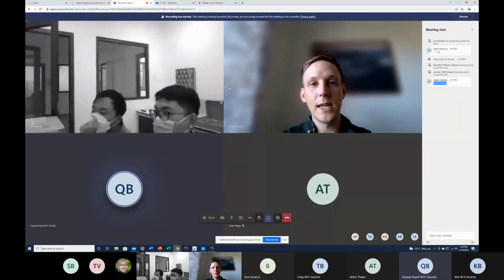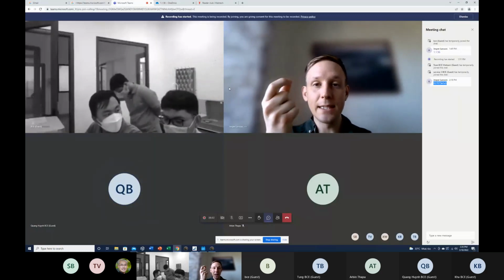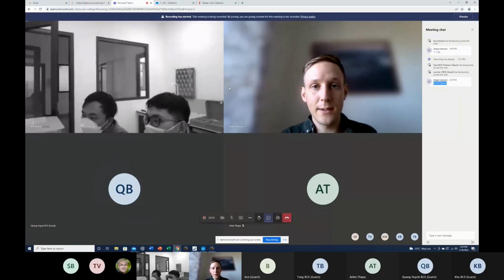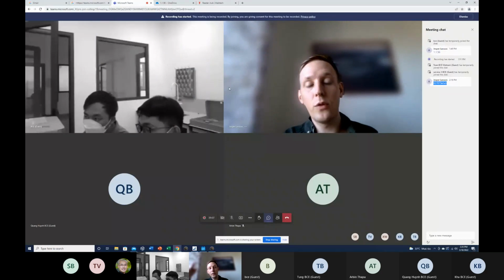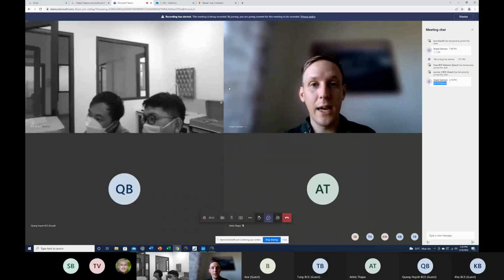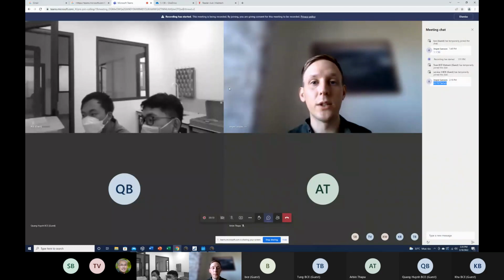Exactly. Every time you're moving the instrument, you're going to take this plate that you have received from us, and before packing it, you read it again and save it to the computer so that you have that readout. Then you move the instrument to the customer site, and at the customer site you're reading the plate again and saving the plate readout, and then you're uploading all that information to the Reader Club all the time.